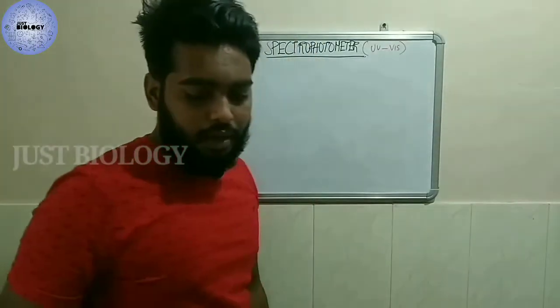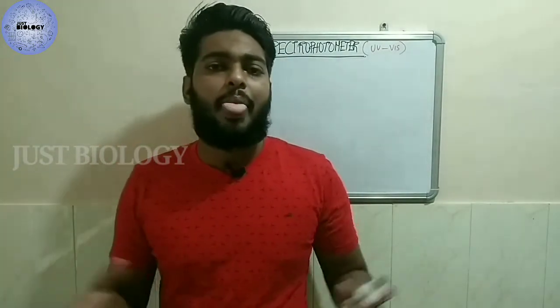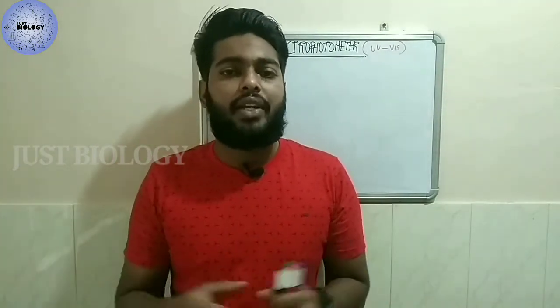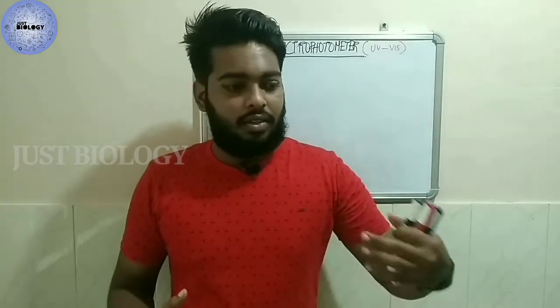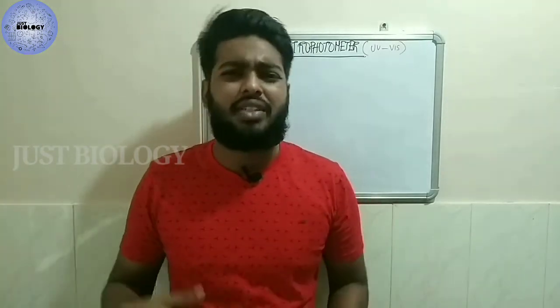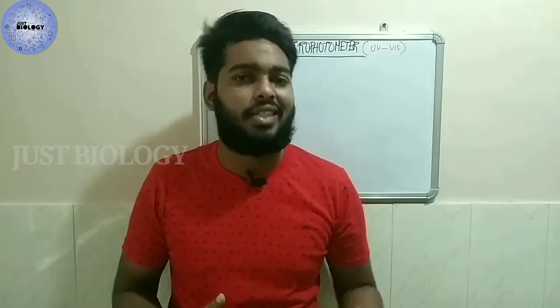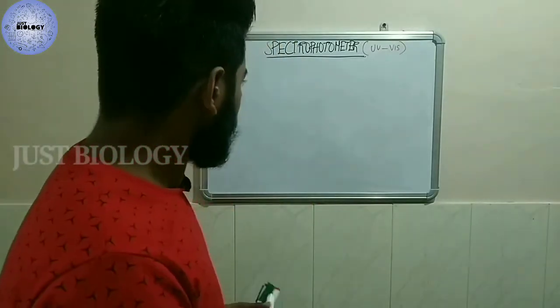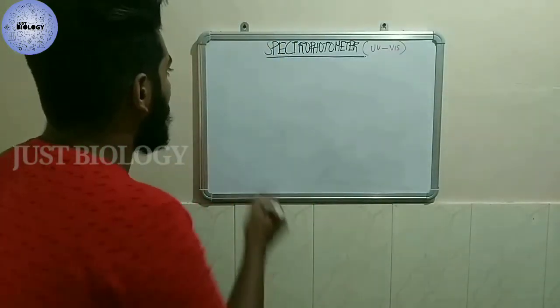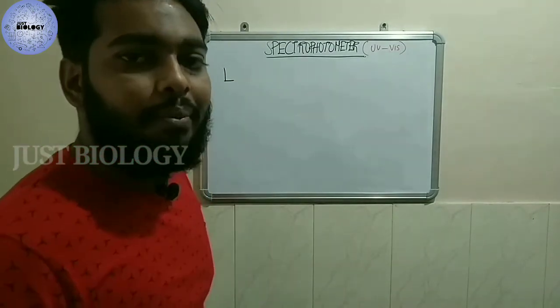If you look at the principle of the spectrophotometer, it is actually a combination of concentration, absorption or transmission, intensity and all. We have many things. We have to do a little bit of physics here. The first thing we want to discuss is a law which we can call Beer-Lambert's law.